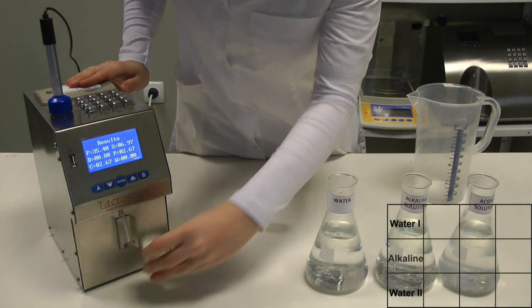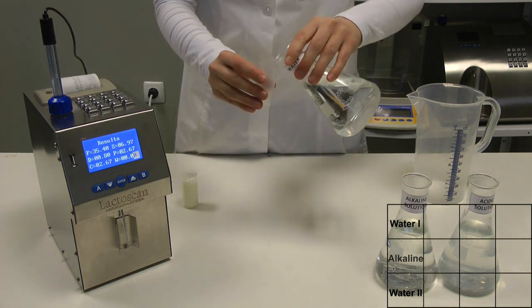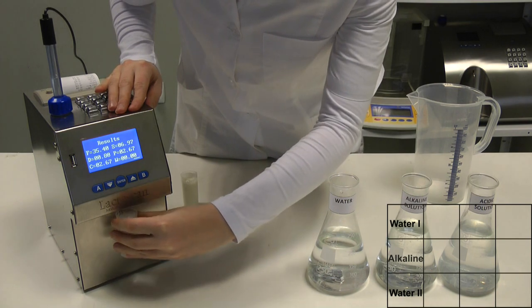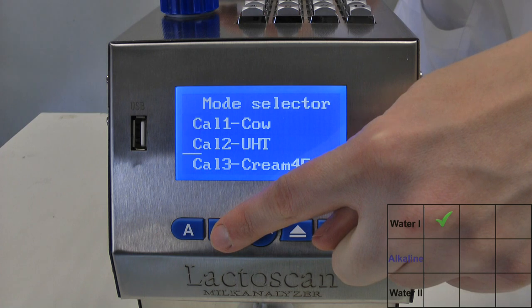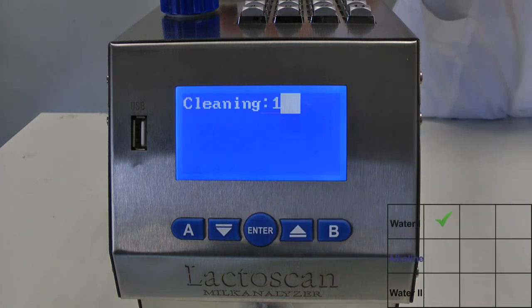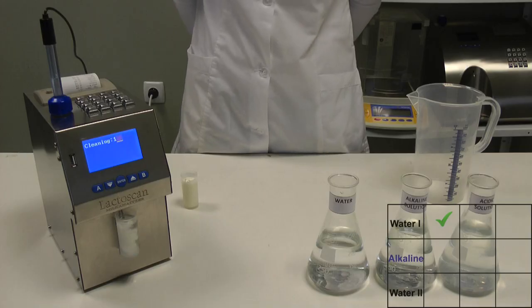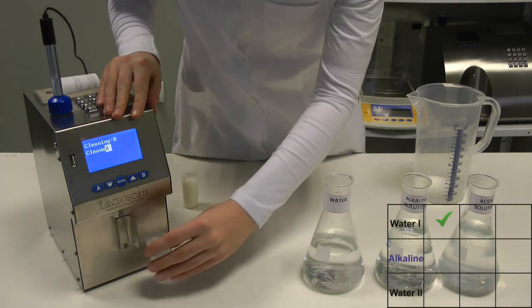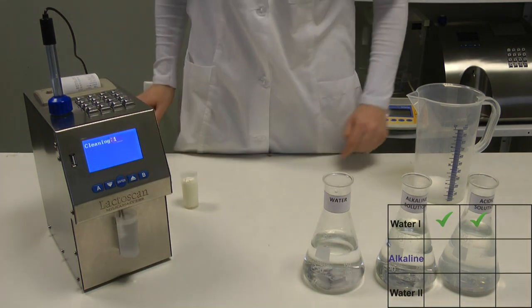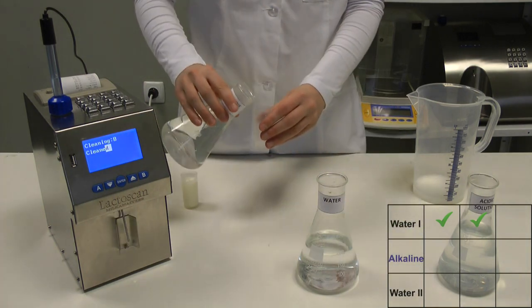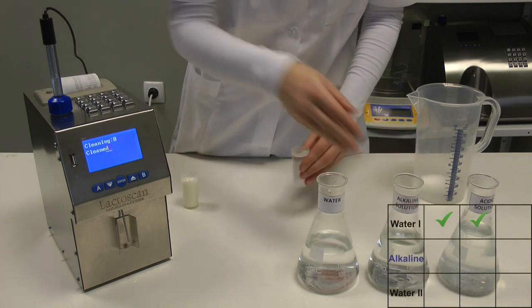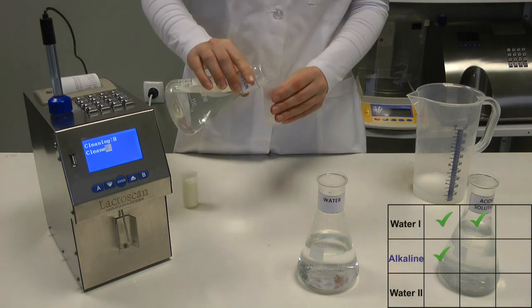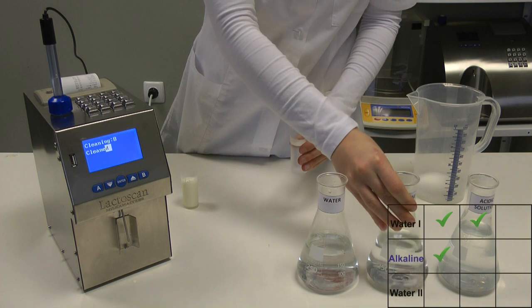Complete cleaning. It is done after finishing work with the analyzer, at the end of the working day, if it is obvious that the measuring system of the analyzer is contaminated in case of intensive work, or after calibration of cream 45 percentage. To do this: rinsing the milk residues, use water twice. Rinsing with alkaline working solution three times. We recommend the temperature of the alkaline solution to be at least 40 degrees. If you have no means of heating up the solution, then just run it several times through the analyzer. It will be automatically heated up then.